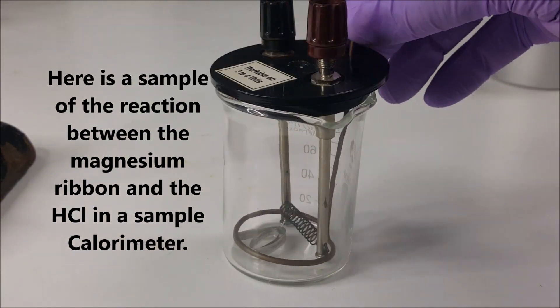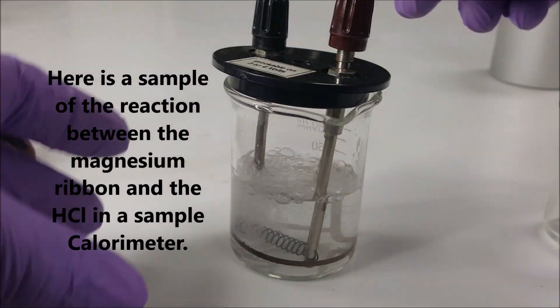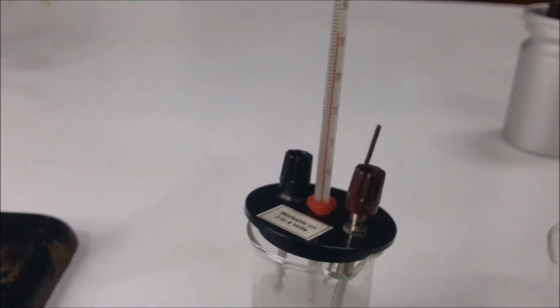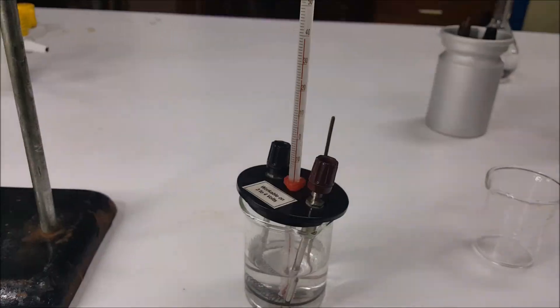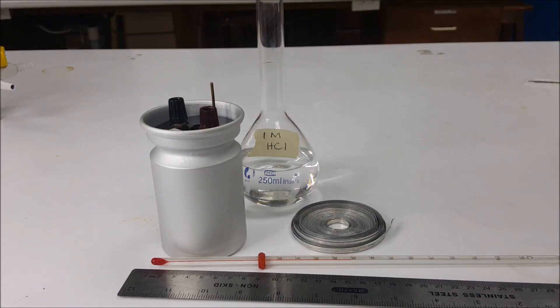We then run a sample of a magnesium ribbon in a calorimeter just to demonstrate what happens in the calorimeter when the reaction is taking place. You will notice that the temperature is slowly climbing, and it eventually reaches about 39 degrees Celsius before it stops.